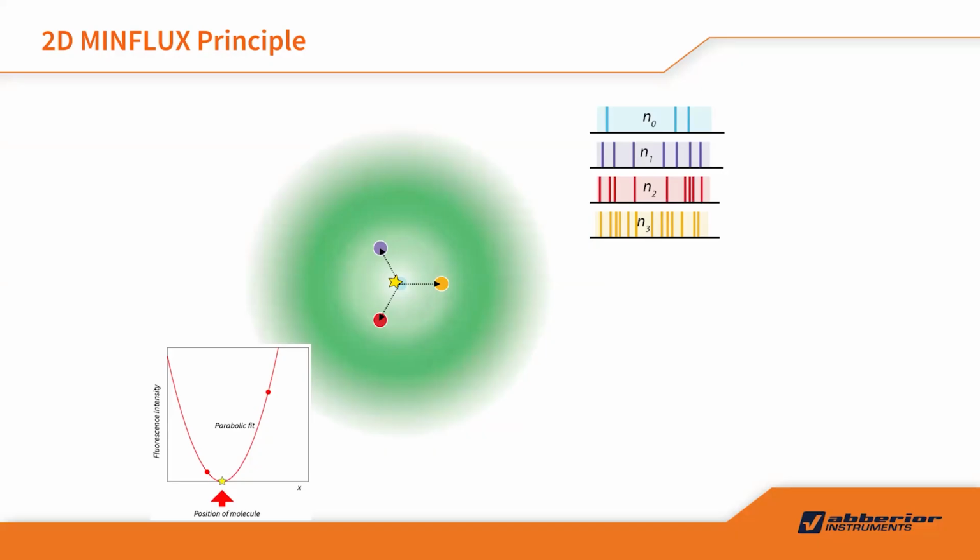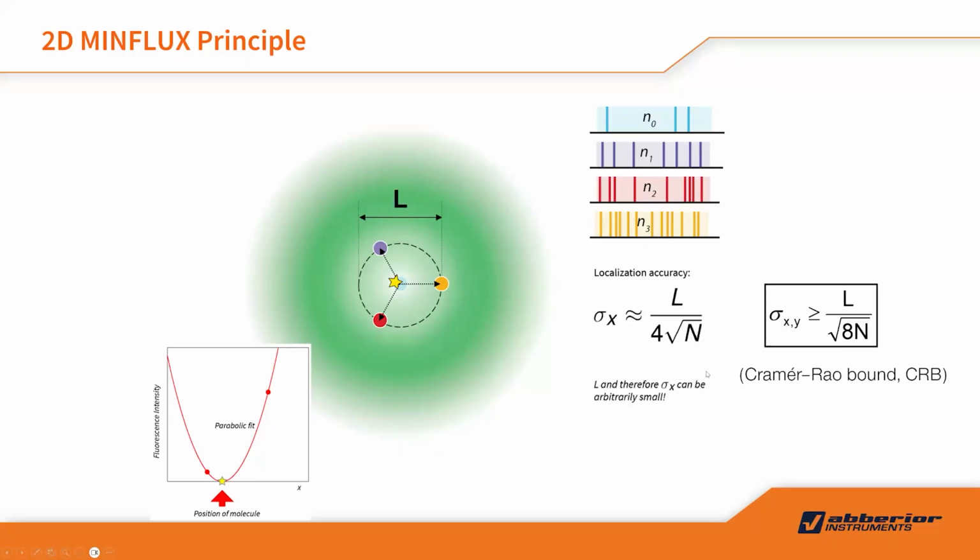This is one thing. There's another thing: we have to be sure your calculation is accurate. So these are two different things. One is to calculate the position, and you are not sure how accurate it is. Then actually the most important thing is the accuracy of the system. It is controlled by this formula.